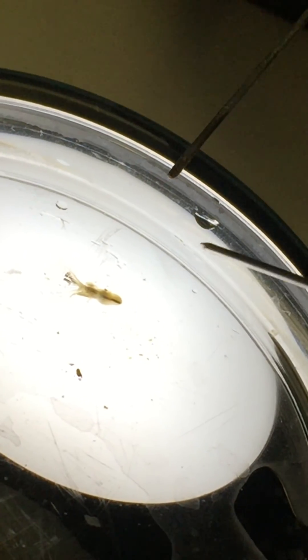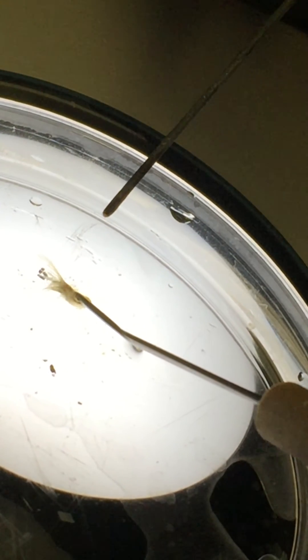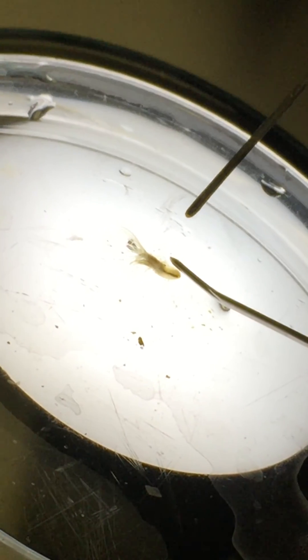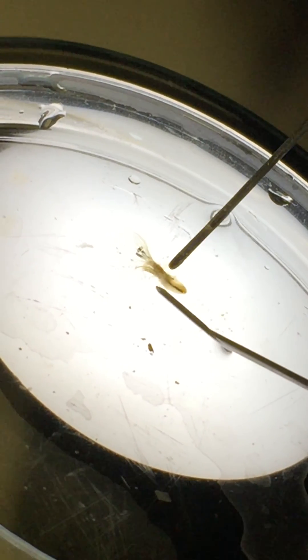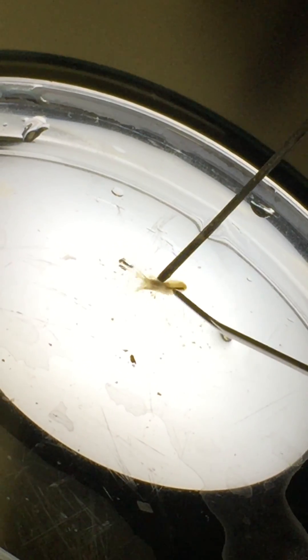Use one of the probes to hold it down. You see how the longer cilia are in the very center? Right where it attaches to the body, you're going to want to put the second probe there and hold down. This is so cool — the way it looks, it really looks like a little shrimp or something. You're doing very well, keep it going.